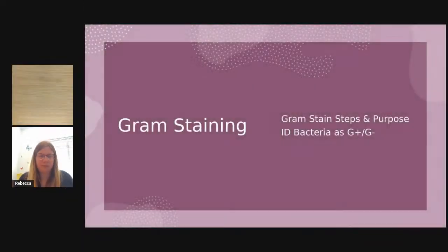Gram staining steps. Okay. So, what are our gram stain steps, and what is the purpose of each of those steps?